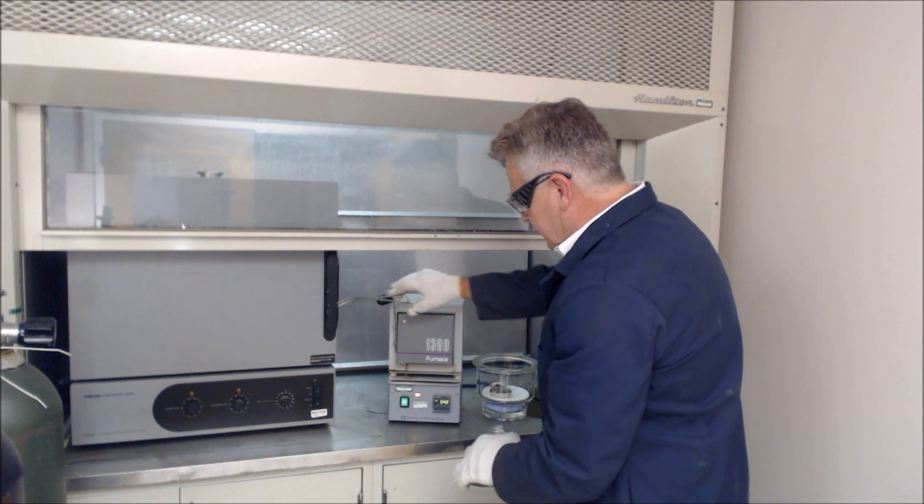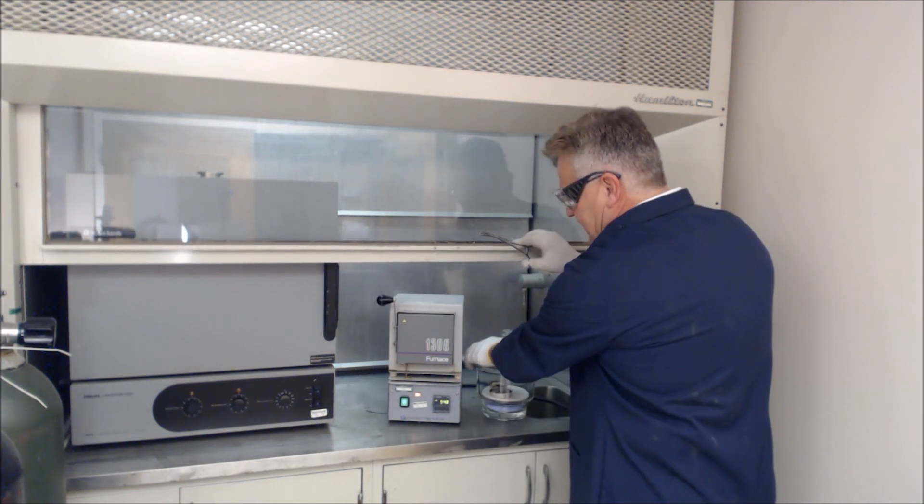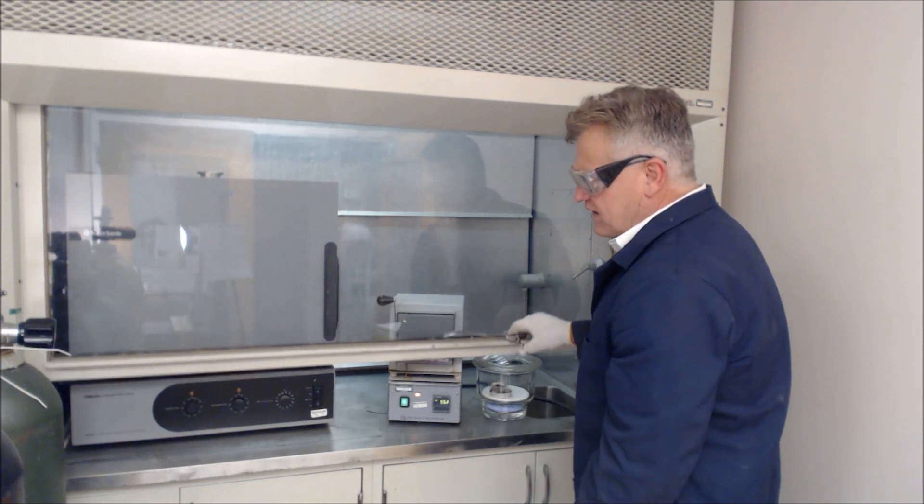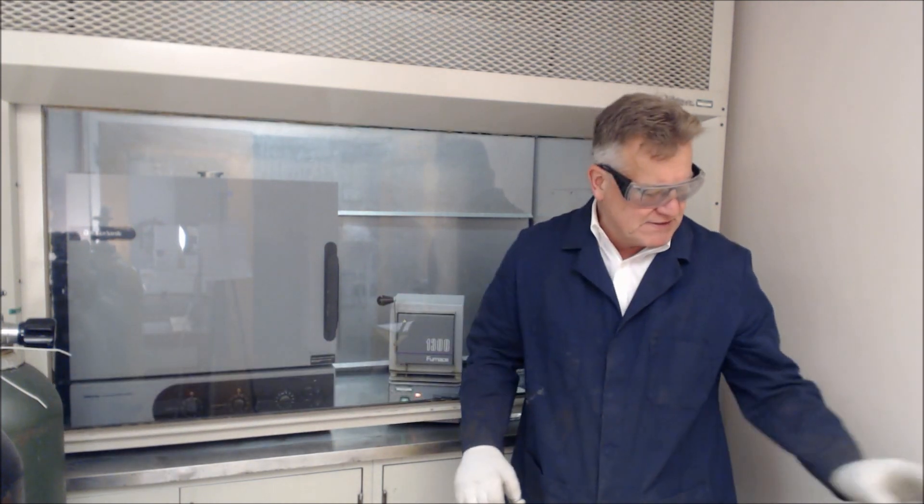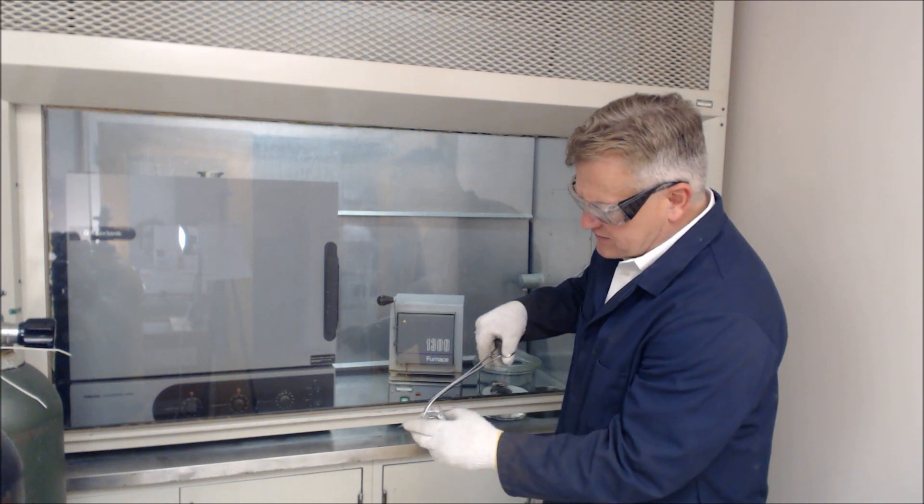Close up the fume hood and subsequently close up the desiccator and now wait for two minutes. We have prepared other specimens in the past. It will give you an idea of what this carbon looks like.